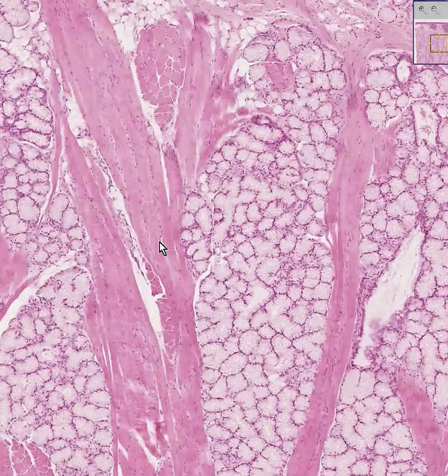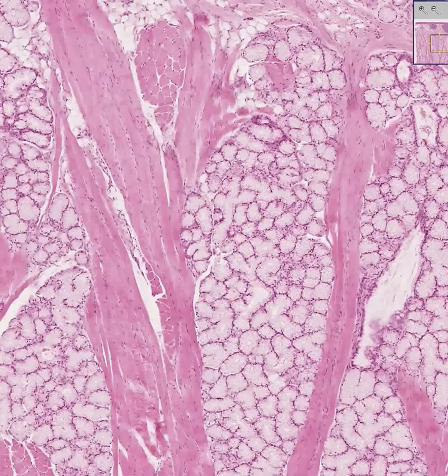The skeletal muscle fibers within the tongue run every which way — cut both longitudinally and transversely — and on that note, thank you very much.